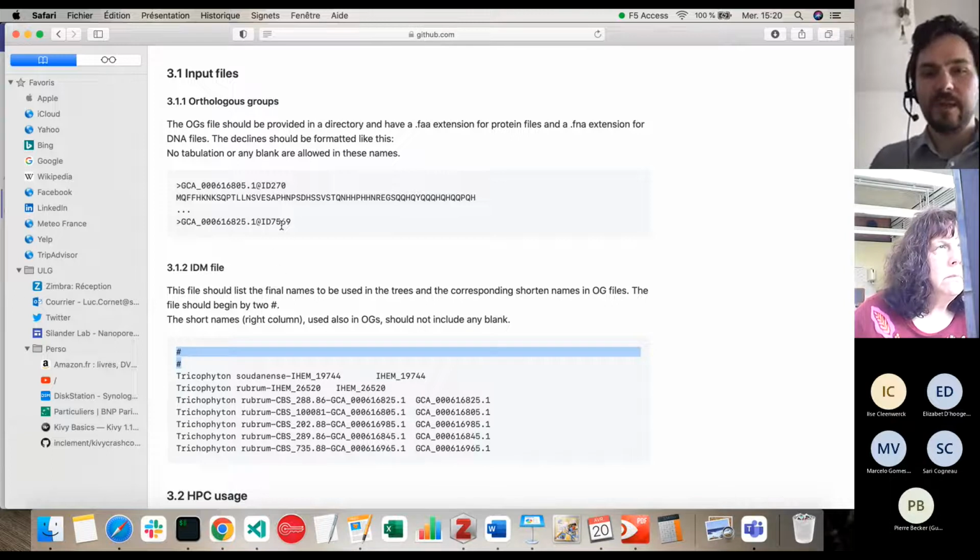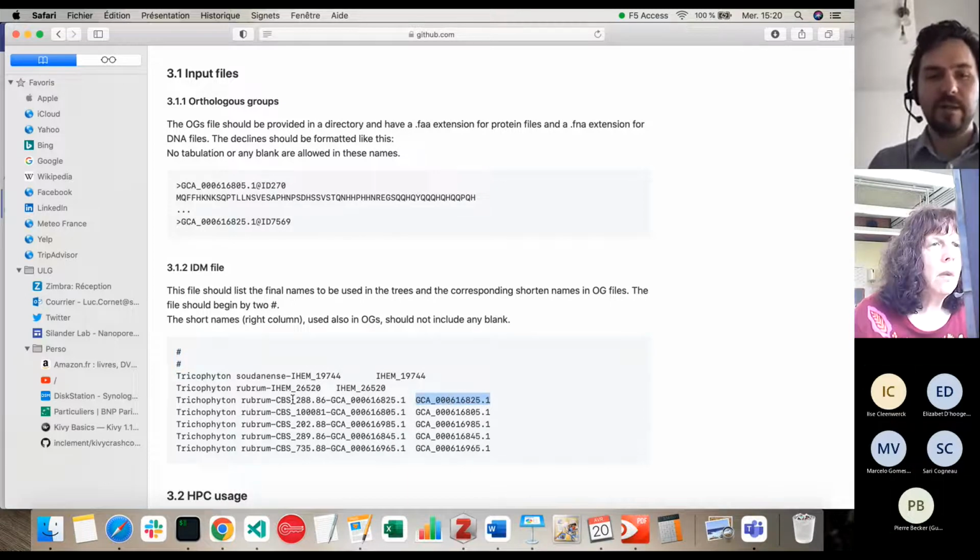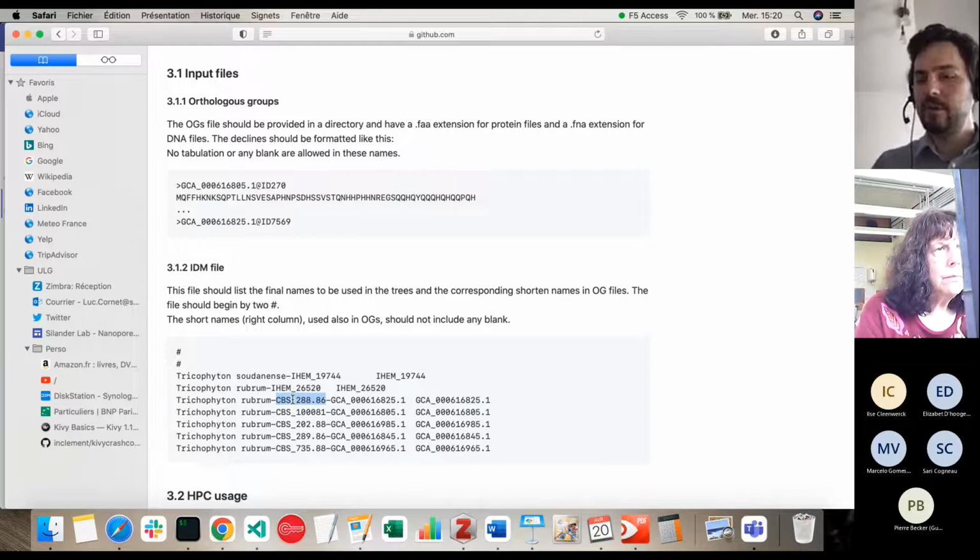With this, once your analysis is done in the tree, the workflow will replace this by this. So you have an already completely formatted tree that you can export, for example, in iTOL or in FigTree, and that you can already put in forms or in figures.